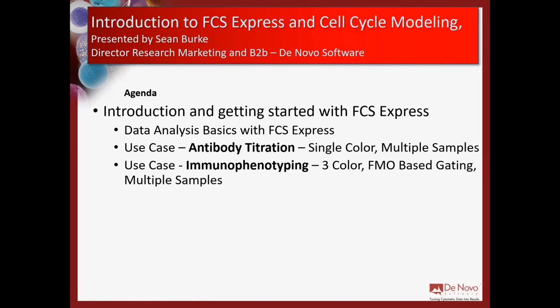Now, as we go through the webinar today, if you have any questions, find the question and answers box in the Zoom meeting. You can ask any questions you might have there. If you'd like to interrupt and ask questions over the audio, feel free to do so. I think you might just have to raise your hand, and maybe Kathy will let you in to ask any questions that you have. But again, don't feel like you can't interrupt today. The training here is for you. If there's something you want to see done again, or something in particular you want to see, raise your hand, ask a question, and we'll be able to go over that with you.